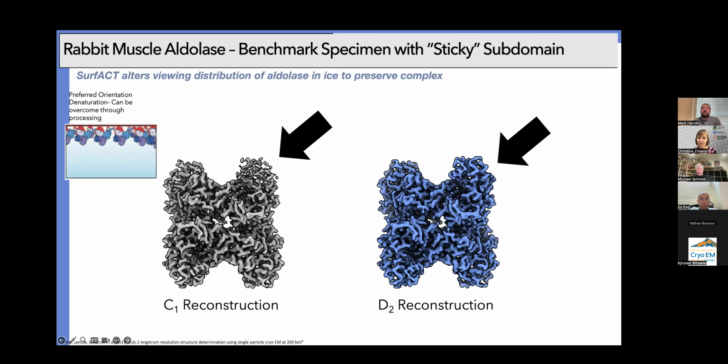Yeah, to that point, there's a really good tutorial on the CryoSPARC webpage about hemagglutinin, about how for that type of specimen with different orthogonal views, where you have a smaller diameter top view and a bigger diameter long view, depending on how you pick the particles, it biases the viewing distribution, and sometimes you need to actually prune out the overpopulated view to reconstruct it.